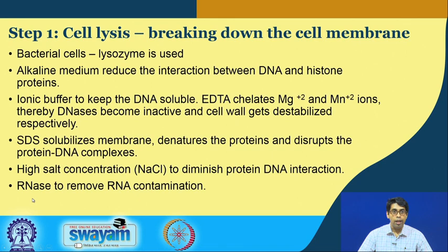And finally, we add RNase to chew up all the RNA that is present in this whole cell lysate solution, because we saw in the previous slide that RNA is less stable, and RNase, this enzyme, selectively degrades RNA molecules. So the RNA will be chewed up, and that will help us to easily remove the RNA molecule.